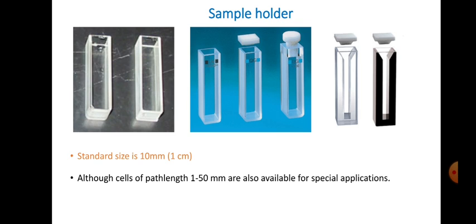Okay, and when we go for biological samples where the amount of sample is very less, we have these kinds of sample holders which require very little amount of sample, as you can see here. The remaining part is a filled part, right? It has the material of construction, and only the center part is vacant, and there we can fill our liquid sample in the diluted form.